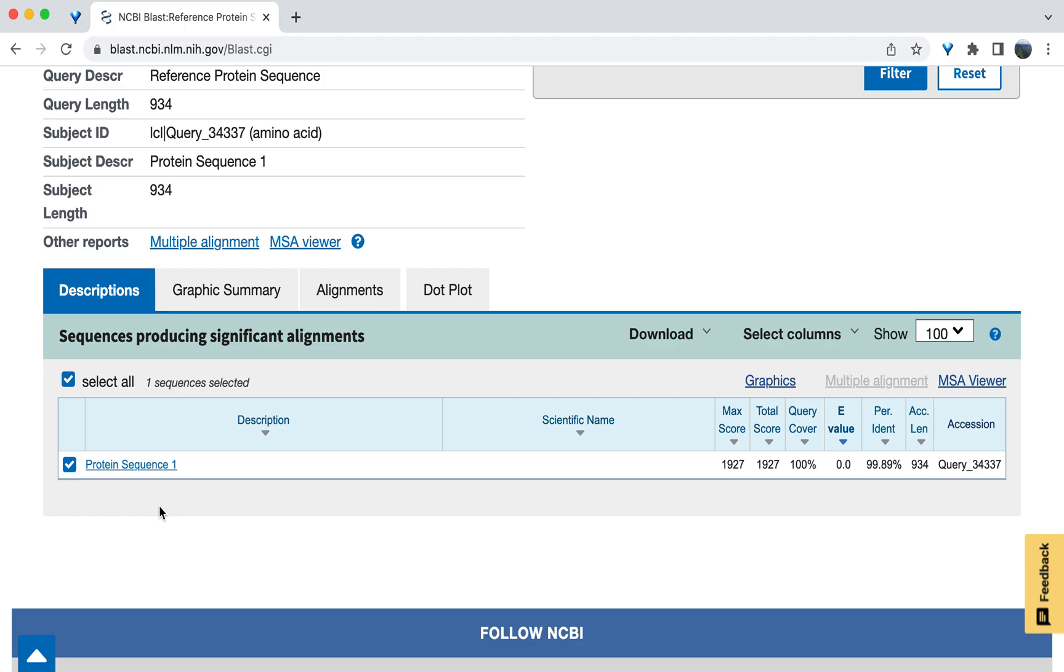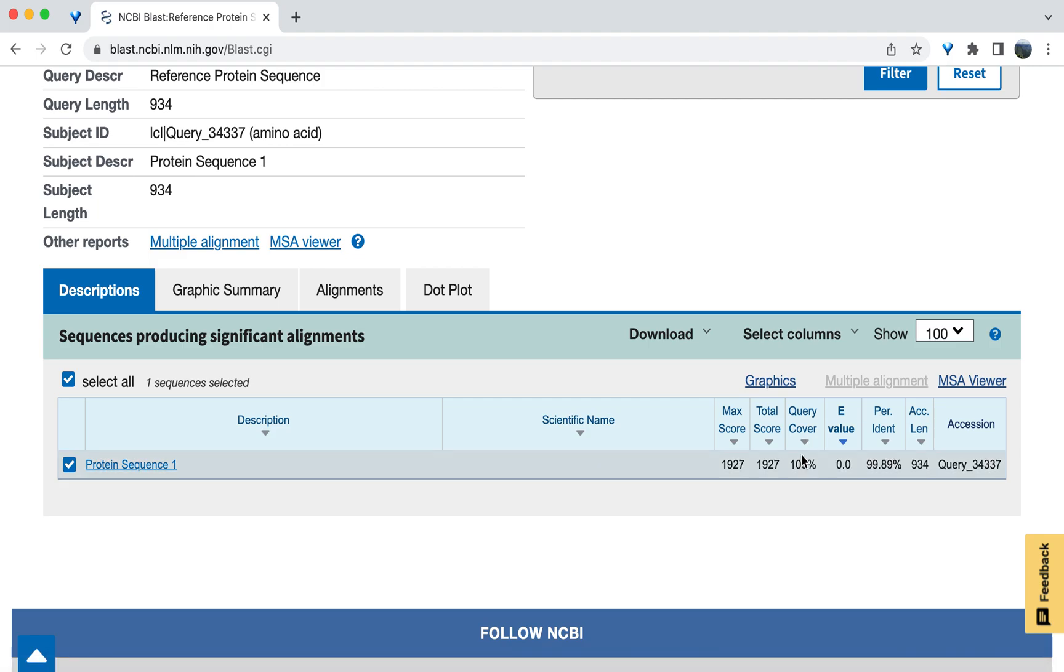Look first at the percent coverage, which is listed here as query cover. In this case, the alignment has 100% coverage. Coverage is an indication of the length of the compared query and subject sequences relative to each other. 100% coverage indicates that the subject sequence spans the entire length of the query, which in this case is the reference sequence.